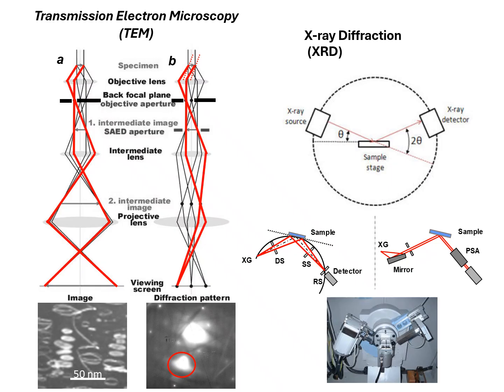And it's quite a distinct difference. This lends itself to a lot more interesting diffraction effects, which I've covered in the other lectures.